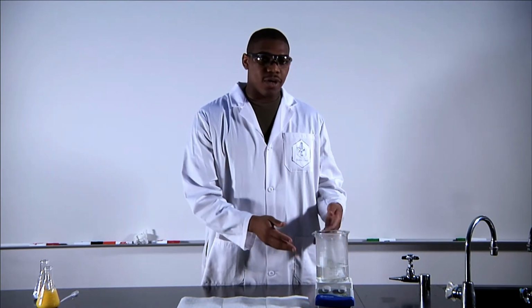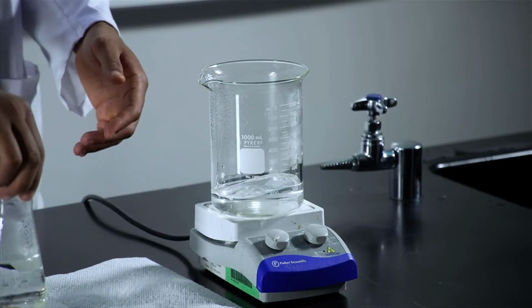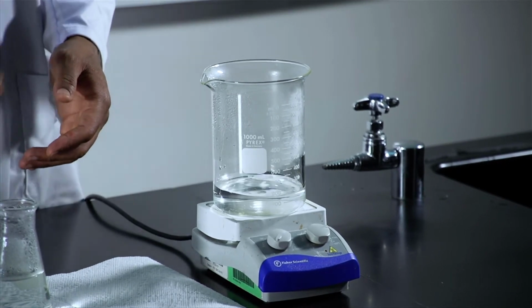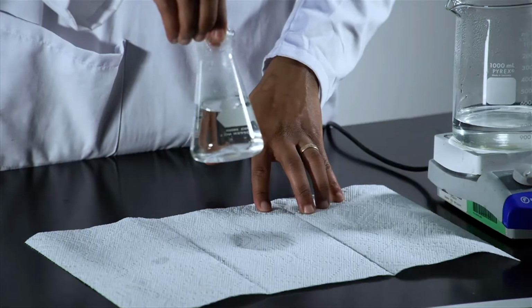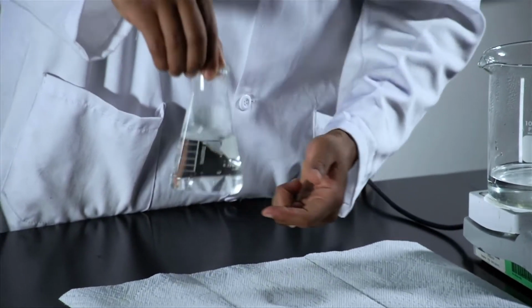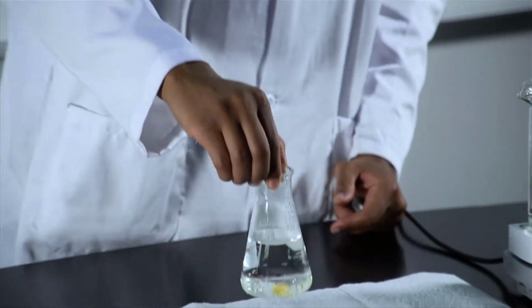All right, so we've put our beaker into the heat. We've had it heated up for several minutes now, and when we take it out, it's definitely a little hot. So, my hands are made of insulated material, so they don't ever get hot. Yours may not be, so make sure you use proper protection. But what you can see here is that the solution is actually clear. There's a little bit of precipitate at the bottom, you may see that, but for the most part, it's redissolved into the solution.